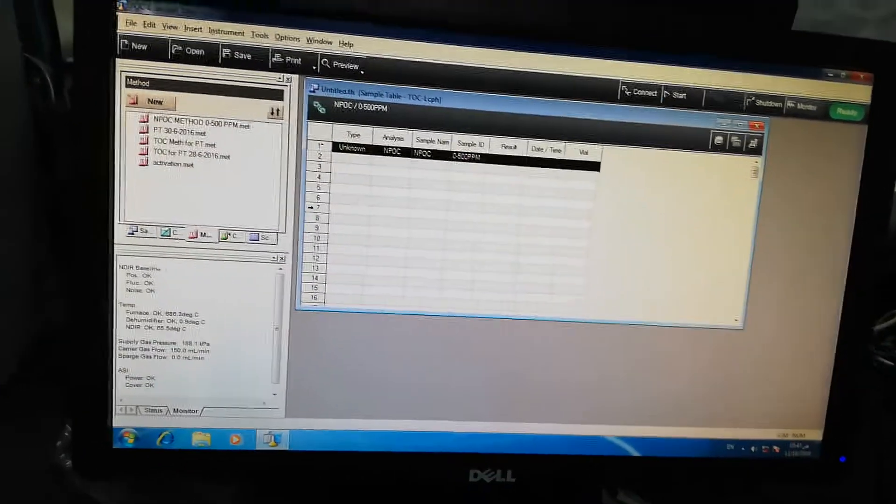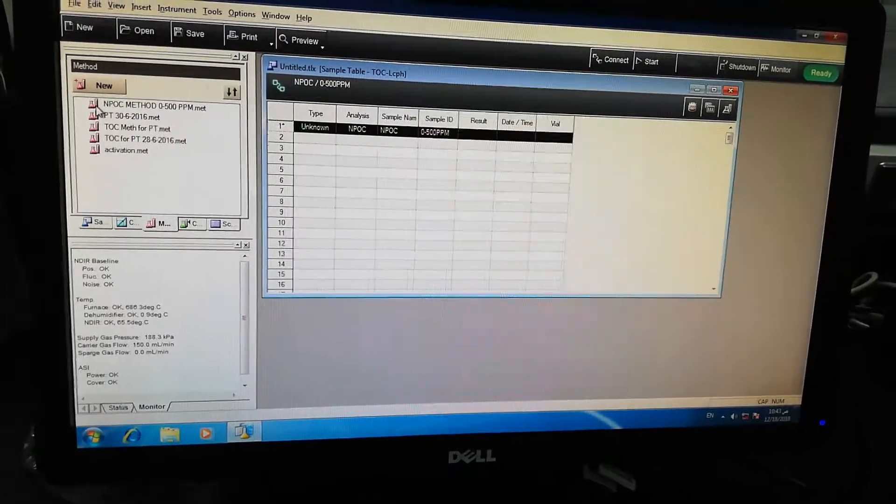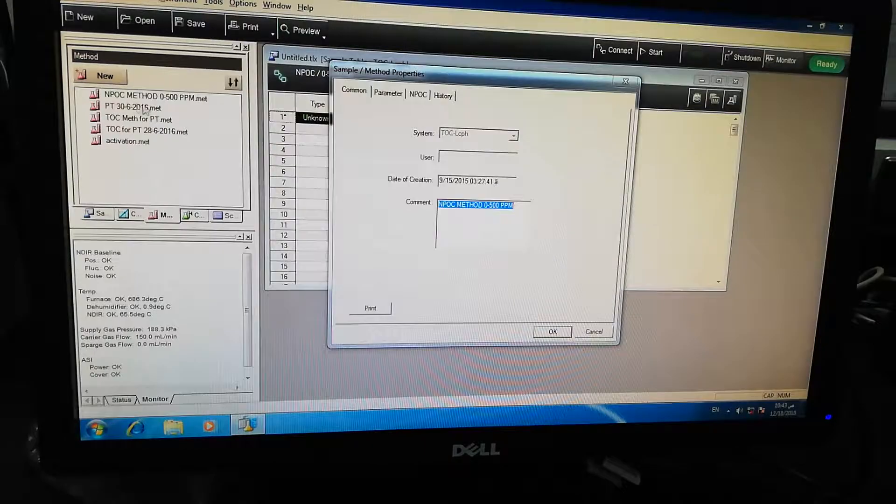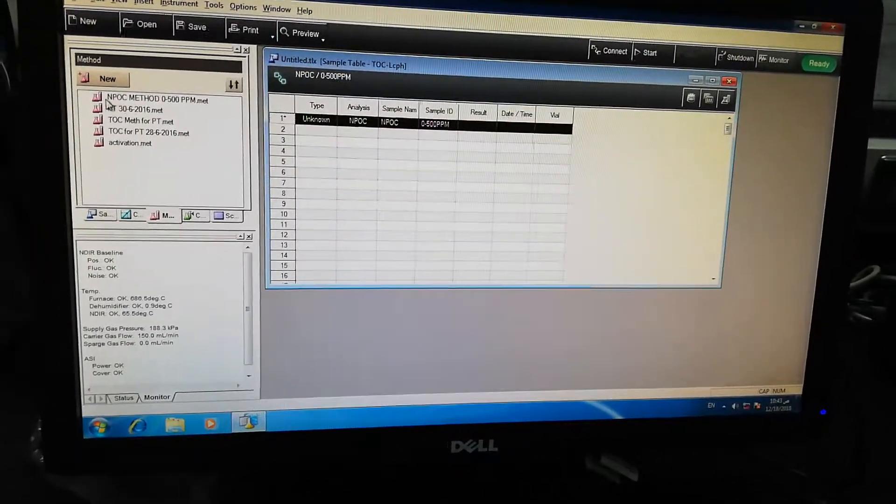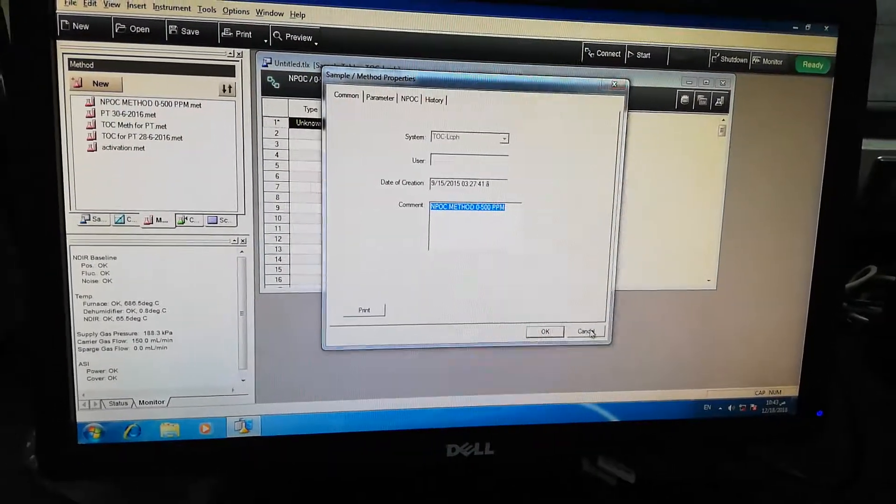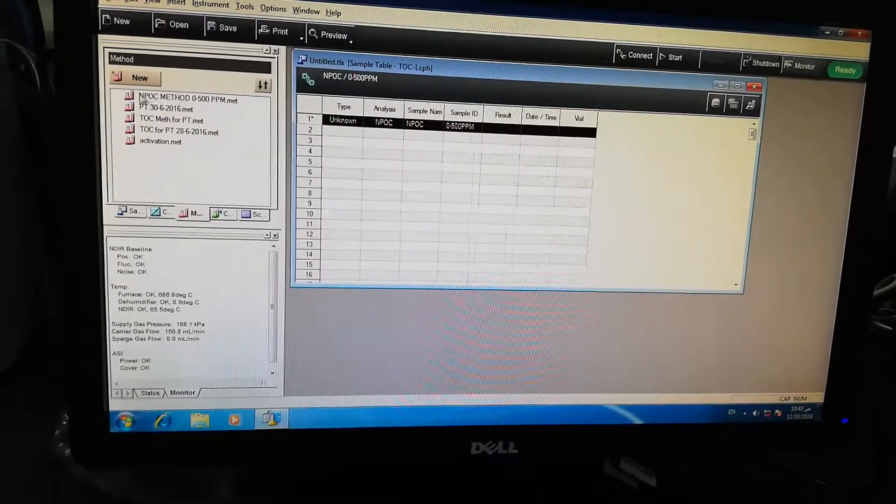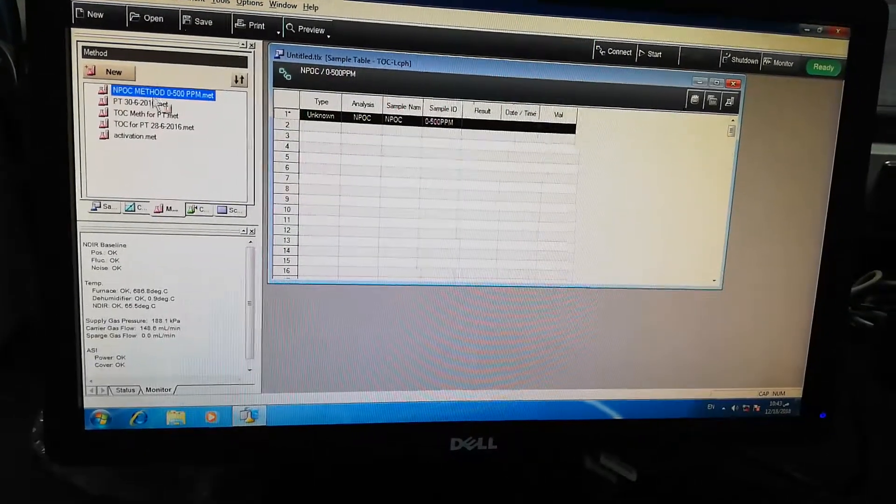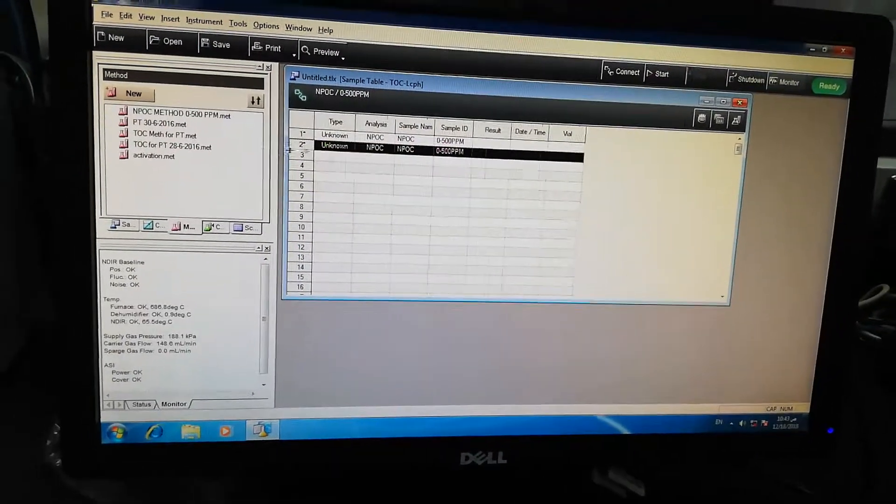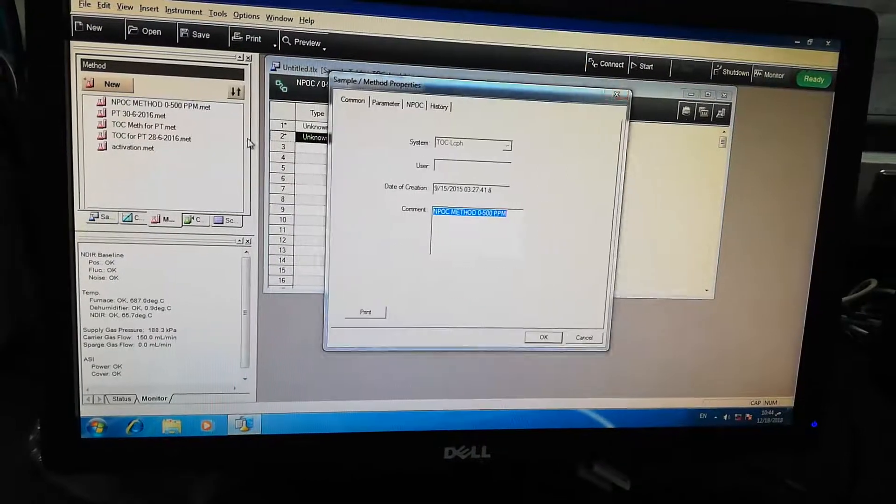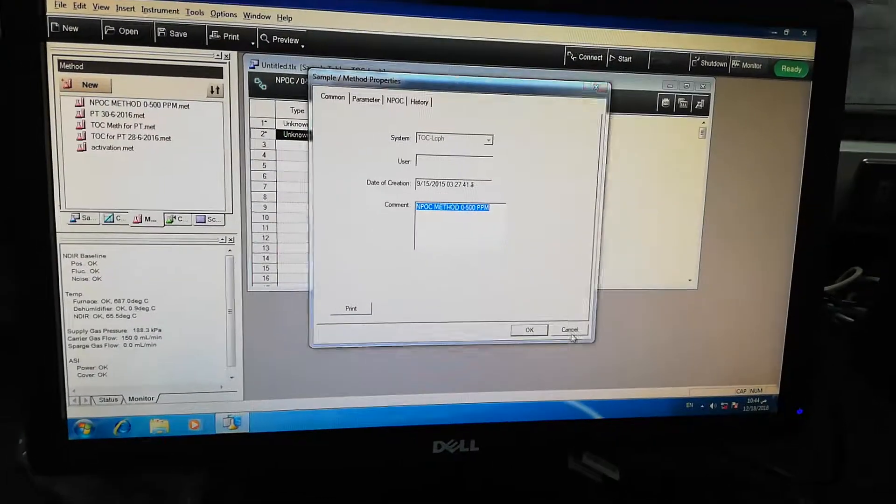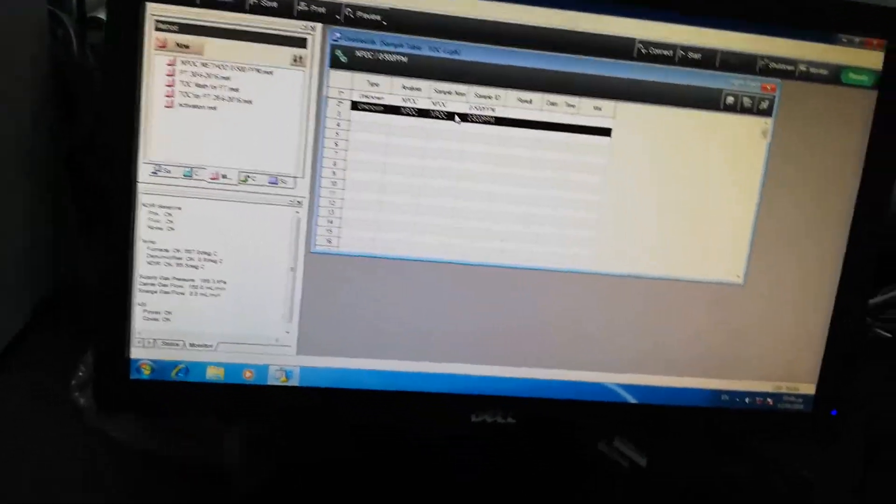First, we will use the same sample line which in the previous video I will drag. So you have to drag like this and you have to take it here. Currently I have dragged only one.